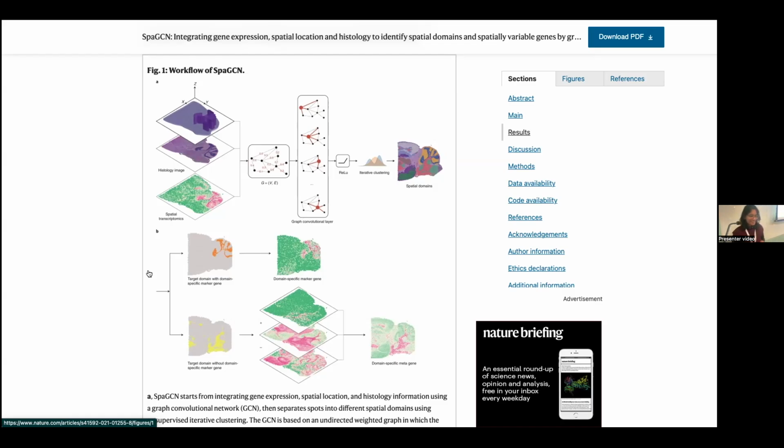Okay, so the concept is that your image, right? We are naive to think, when you are looking at an image, especially an H&E image, that it's just RGB values. These are not fluorescents. So the overall distributional pattern is actually a net result of all your cell types.